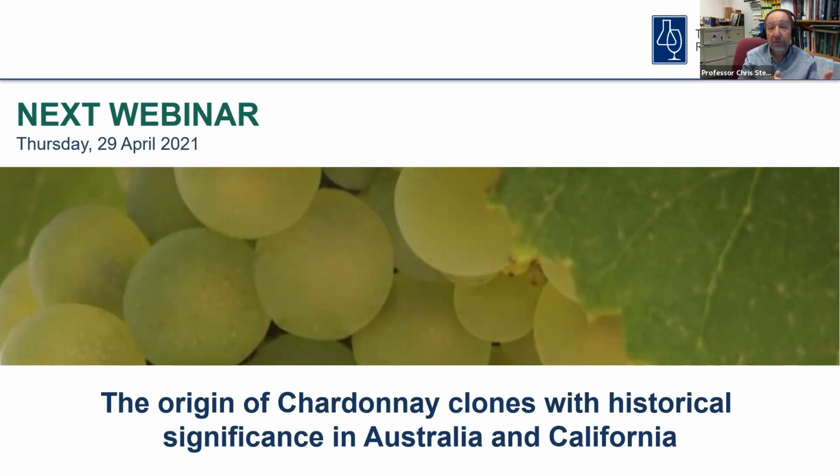I was going to show, but I don't think it was relevant for this webinar, some data that I've got on the dessert wines where it goes up really, really steeply. But that's what you'd have to do. The thing is, you don't know what's there till you do the reading. But it's a bit like measuring the absorbance of something in the spectrophotometer. You shouldn't measure the absorbance when it's greater than 1 because of Beer-Lambert's law. You need to dilute your sample. So with gluconic acid enzyme assay, if you're getting readings of above 1, then you have to dilute it. It's the same sort of principle, really.